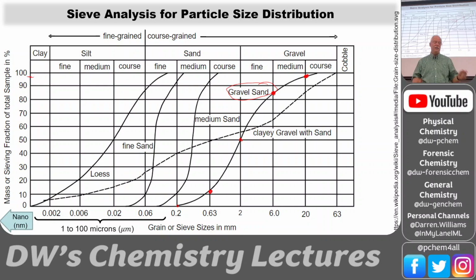Okay. And so this person was saying, okay, I pour it in, I weigh it, dry it, weigh it, pour it in the top, and I pick out the big pieces because they're not the powder, right? And the guy was like, ding, we know now what's going on. You were pulling out the pickers. Don't do that. Leave the pickers in there. That's that top sieve that's going to capture those big pieces, okay? And so that was interesting.